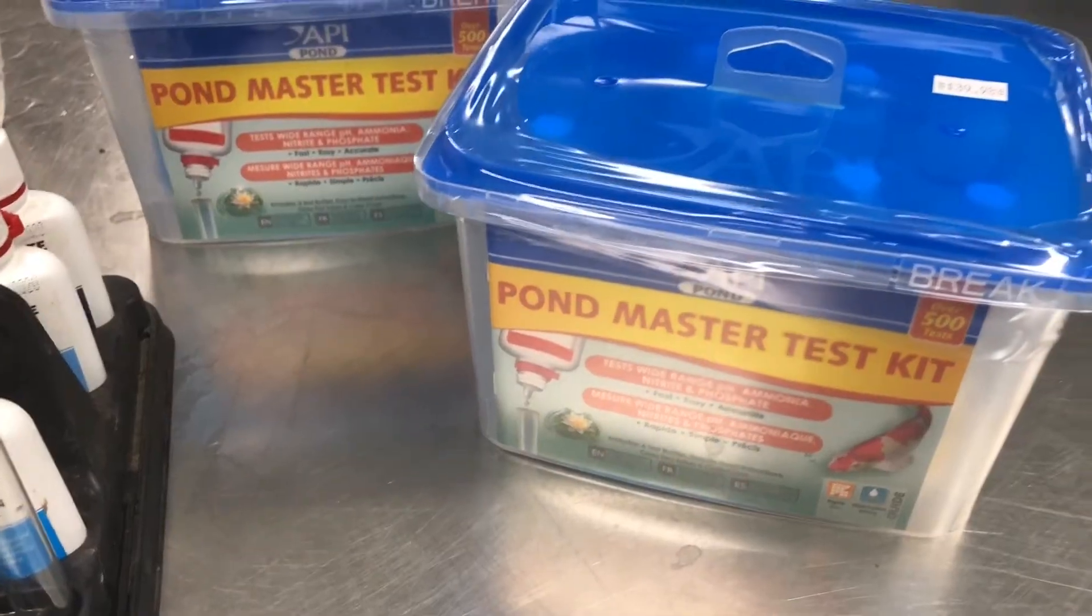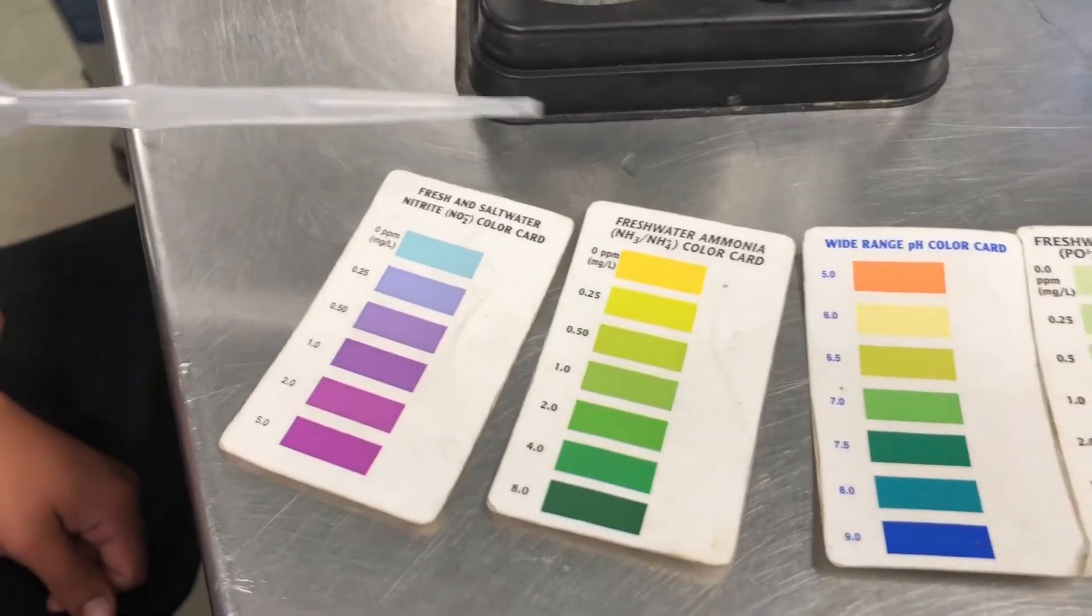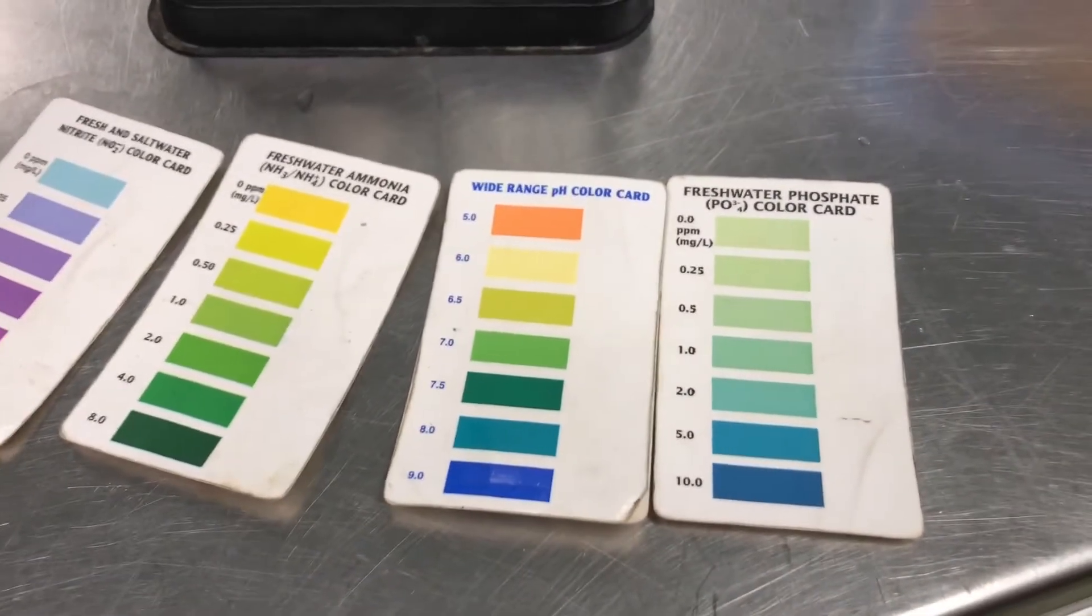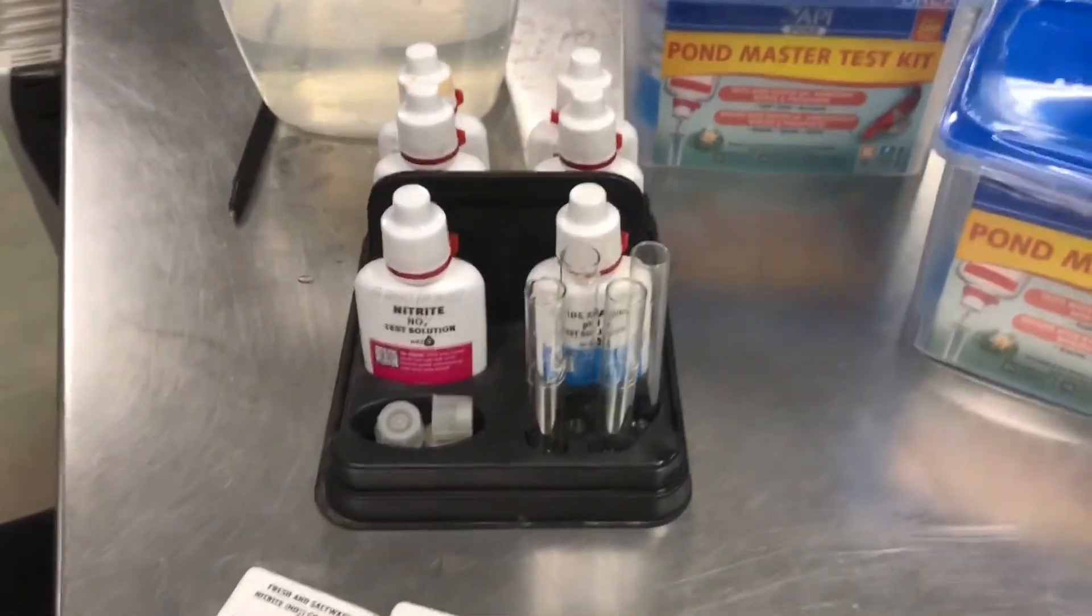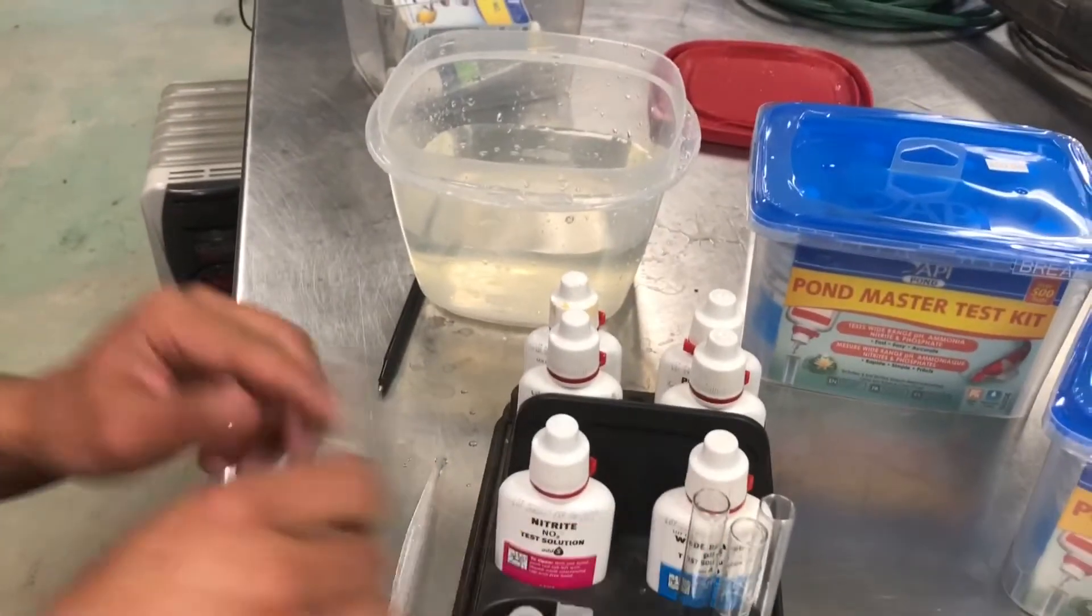And it tests for four different things. It tests for the nitrites, ammonia, pH, and phosphates. So I want to show you how the kit works and what you have to do. So what we're going to be doing is testing some pond water a customer brought in.